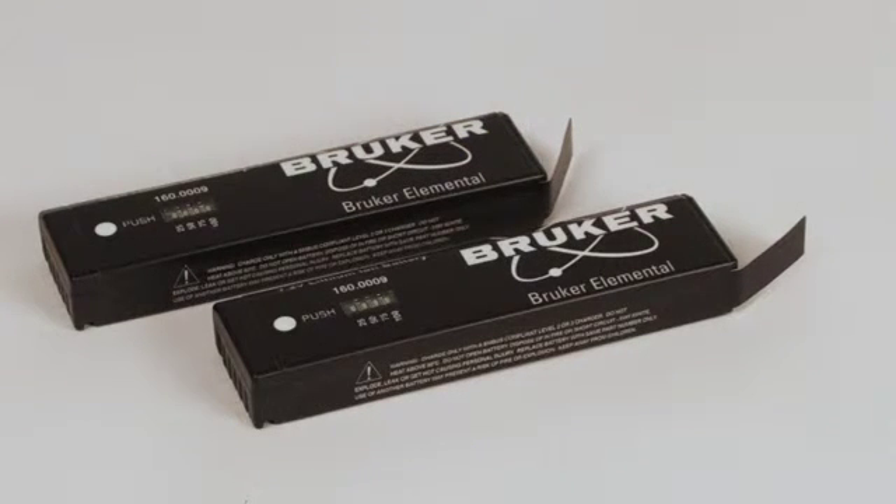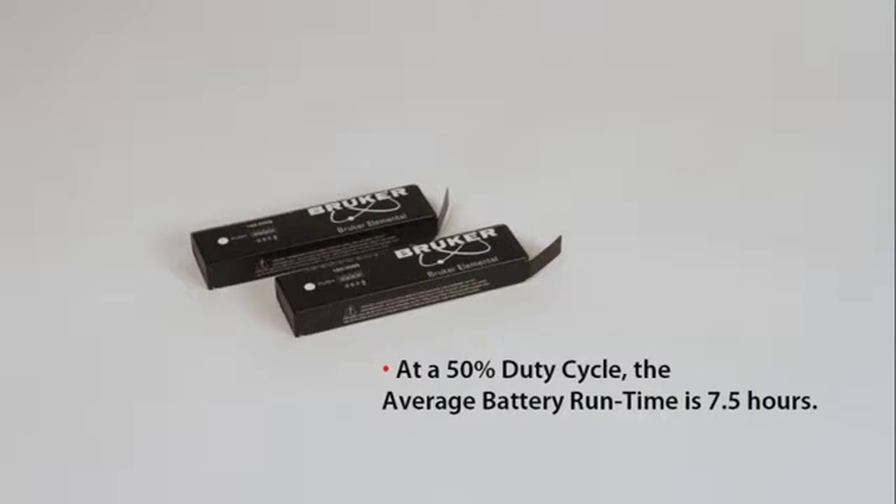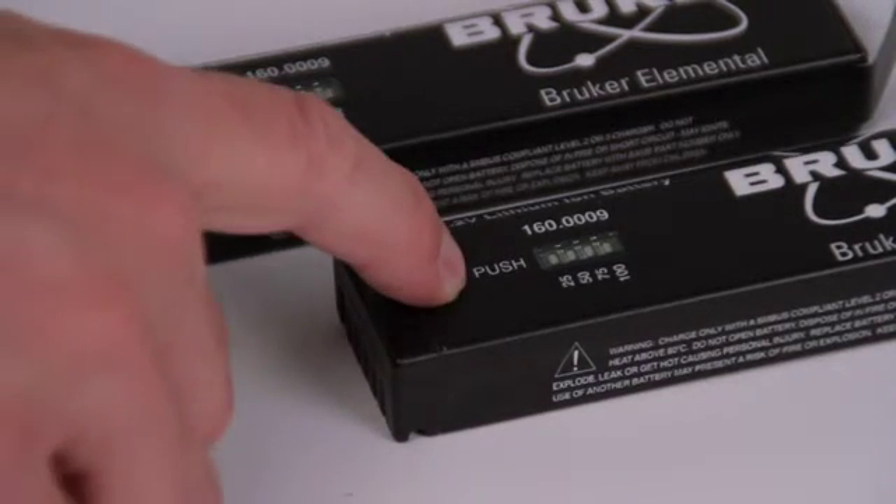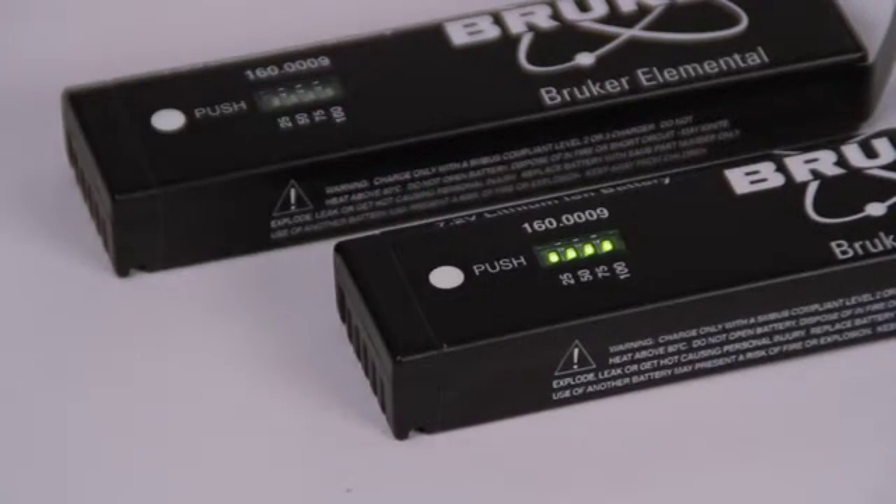Two lithium-ion batteries are supplied with the analyzer. Each fully charged battery can operate the analyzer from 6 to 8 hours depending on how often the X-rays are generated. At a 50% duty cycle, the average battery run time is 7.5 hours. Pressing the button on the side of the battery will illuminate a fuel gauge that will indicate the relative charge level of the battery. Four illuminated LEDs indicate a fully charged battery.